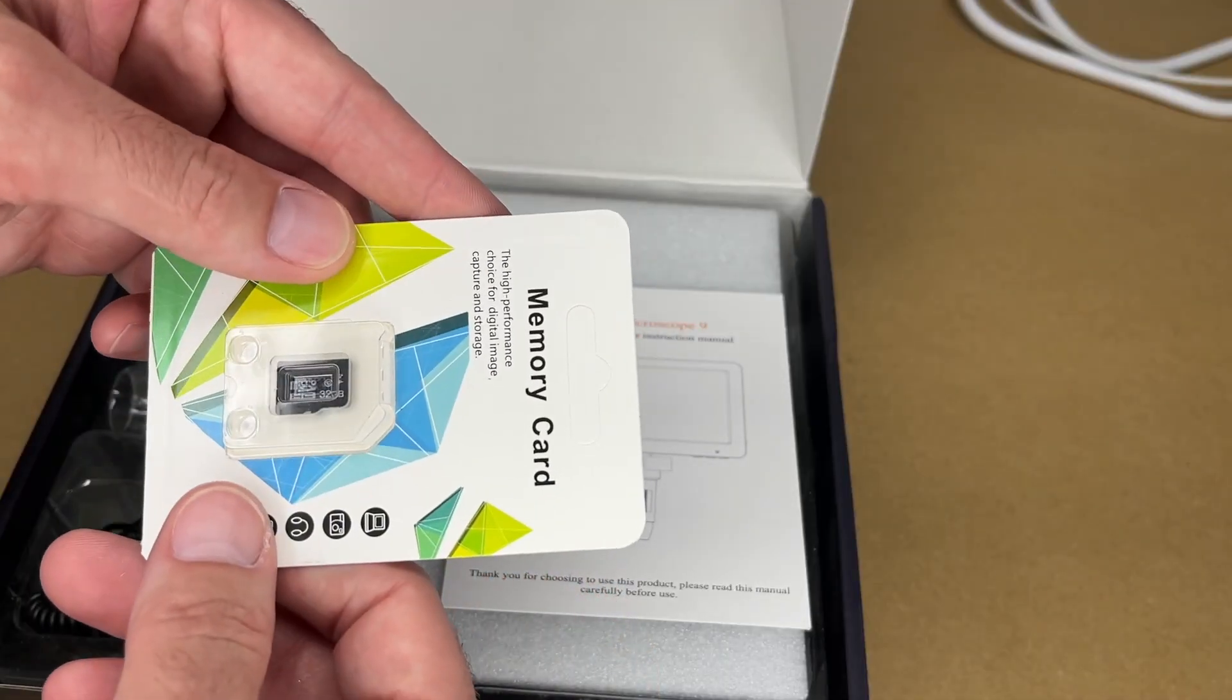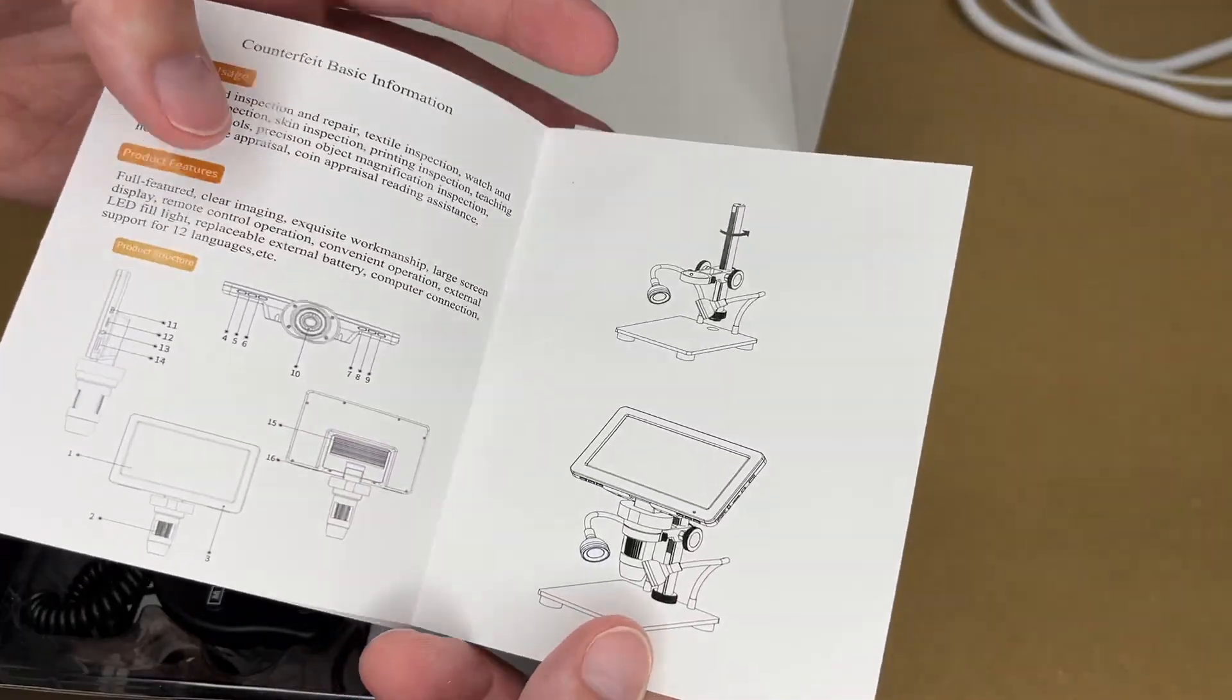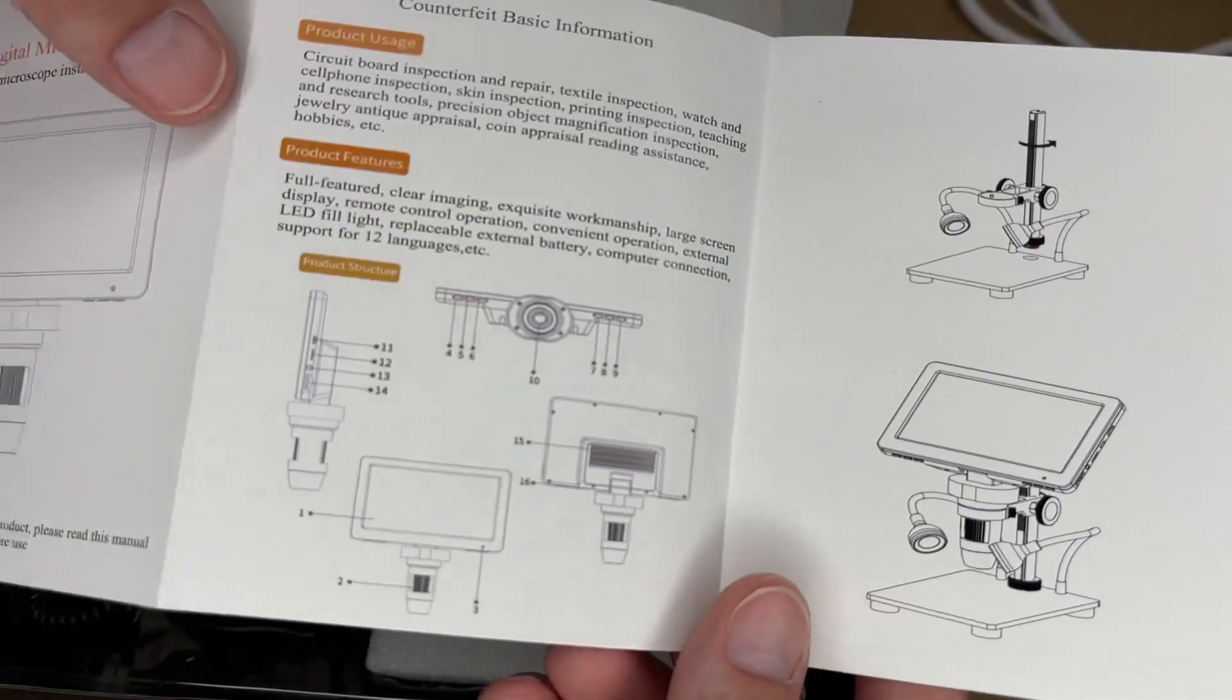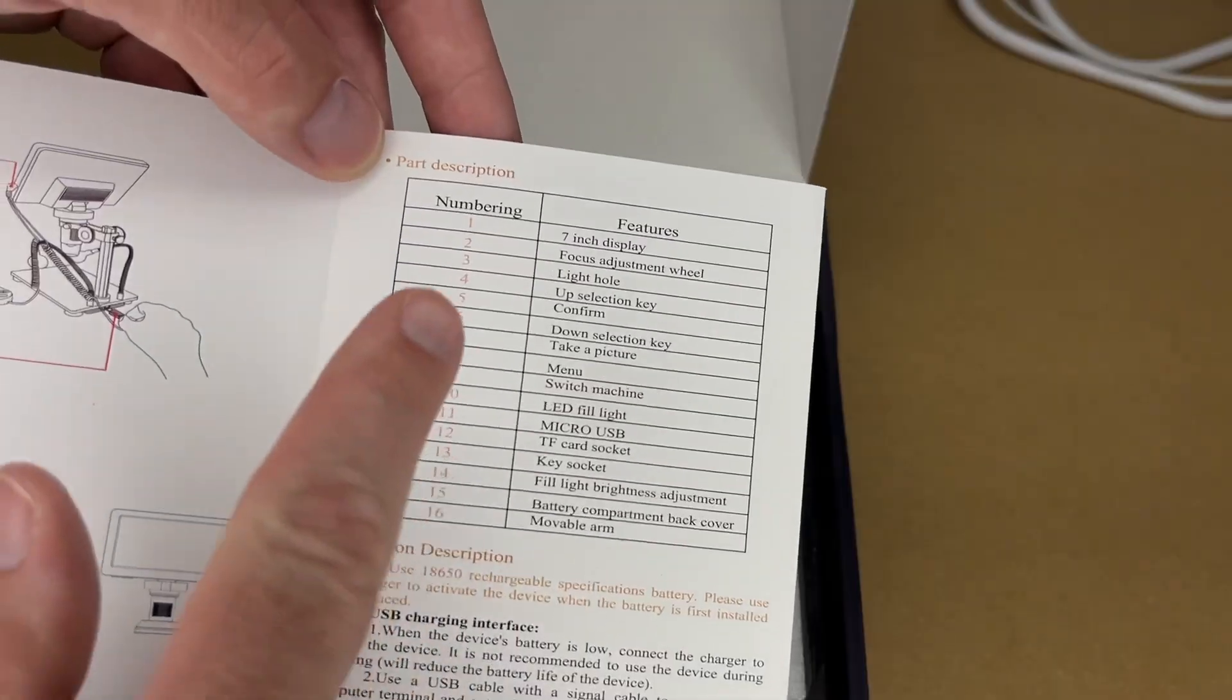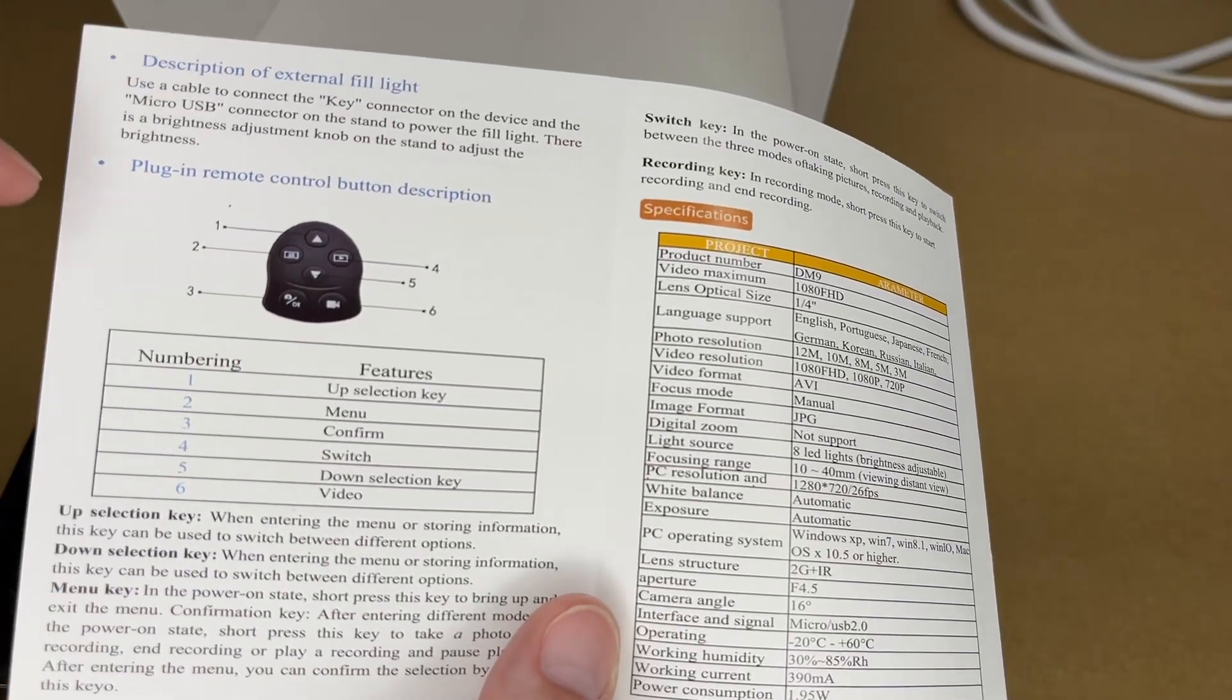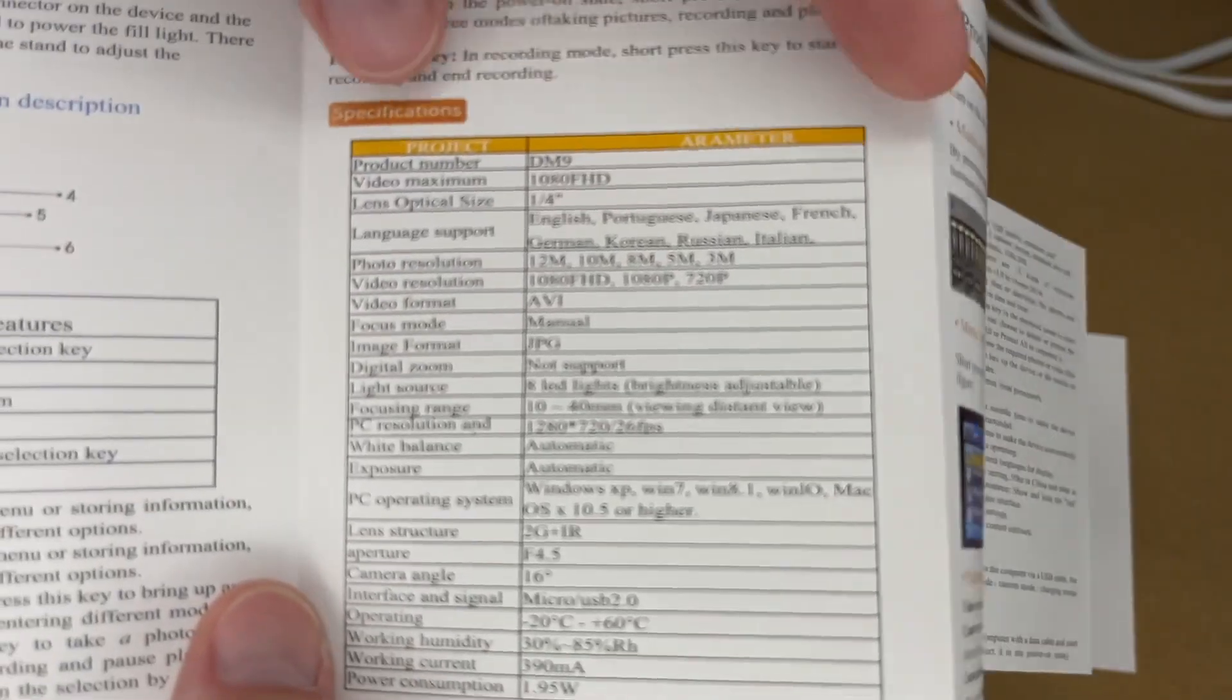So it comes with a 32 gigabyte micro SD card. Looks like this is an instruction manual. This talks about the different parts here. Here are the part descriptions. This talks about the fill light, plug-in remote control.